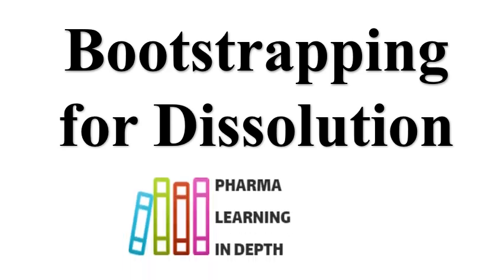Different techniques are used to show the dissolution profile similarity between different formulations. The formulations may be reference formulation and the test formulation, or it may be the formulation with some changes. Also, it may be the higher strength formulation and the other strength formulations.